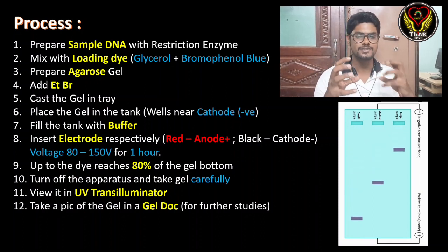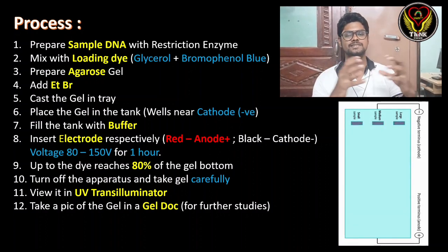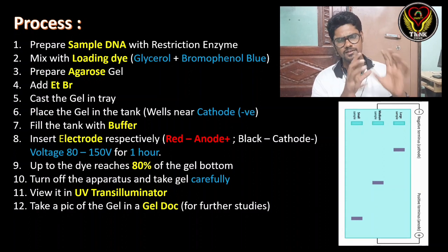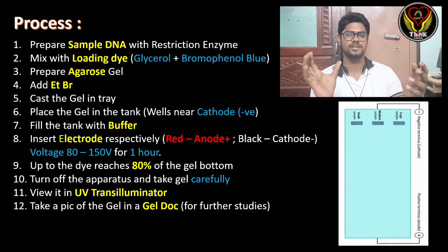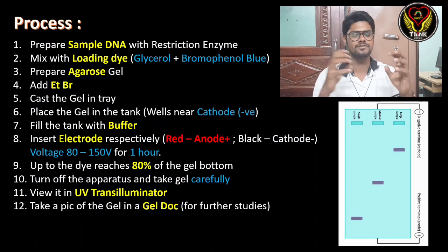The third thing is to prepare the agarose gel. Based on our need, we will determine the concentration of agarose, prepare the gel, and add EtBr. EtBr is an intercalating agent. It will help with visualization. The fifth important thing is to cast the gel in the tray. There will be a gel casting tray. We will pour this gel and let it solidify, and our gel will be formed.